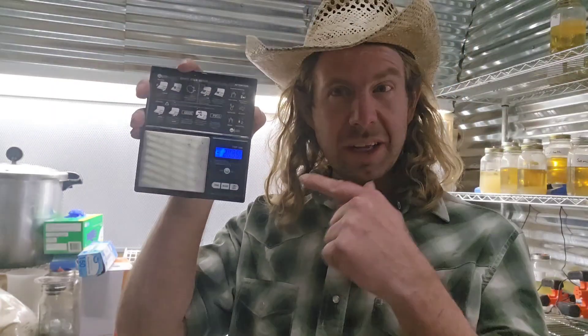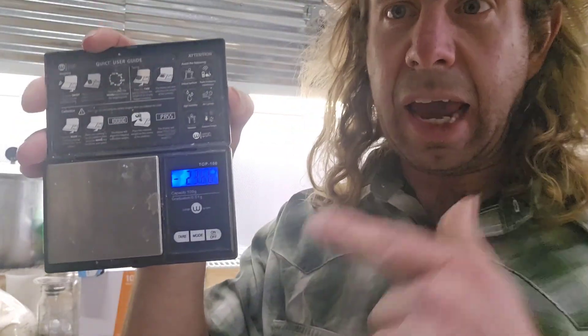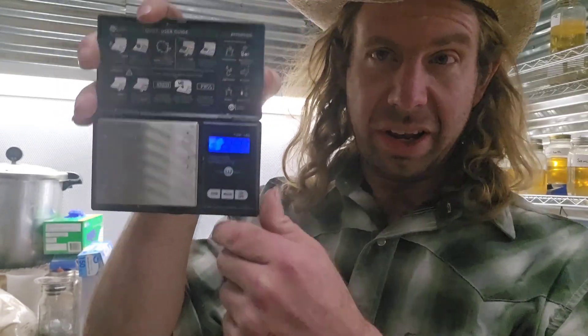Number twenty: scale. Everybody needs a scale. This will be handy when you're weighing your ingredients for your liquid culture or your agar, and you can also weigh mushrooms on it. Number twenty: gotta get a scale.